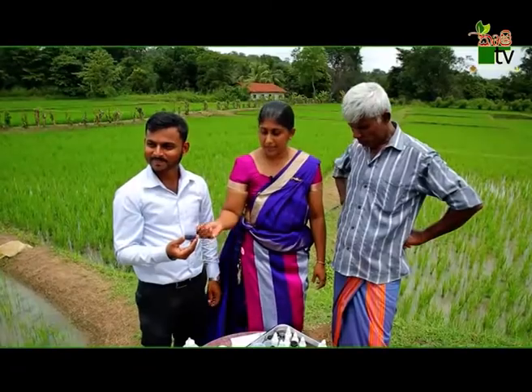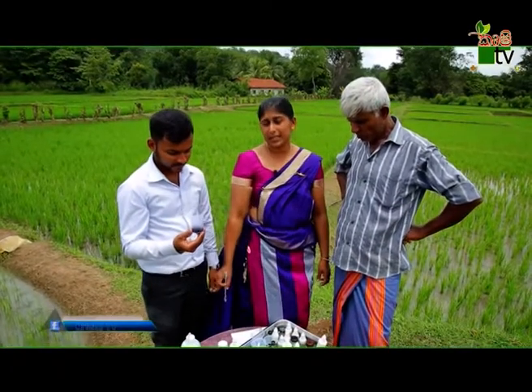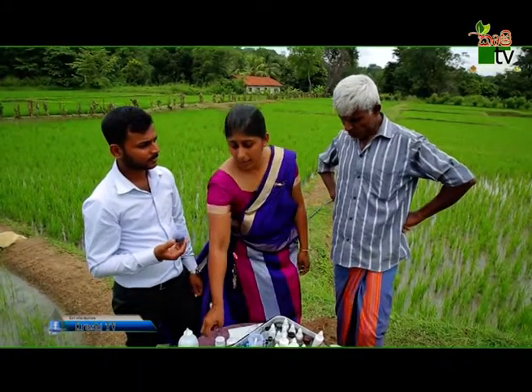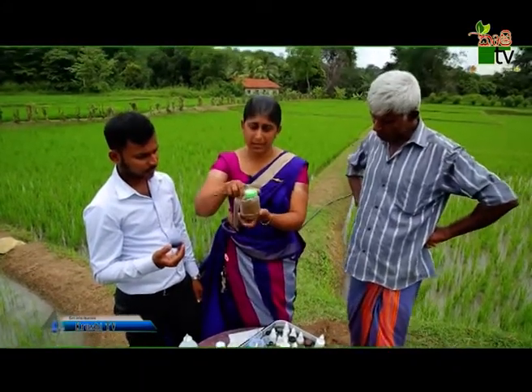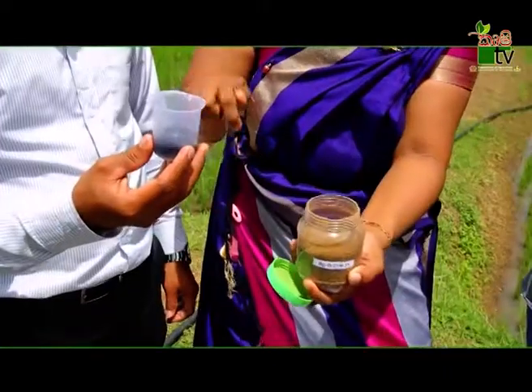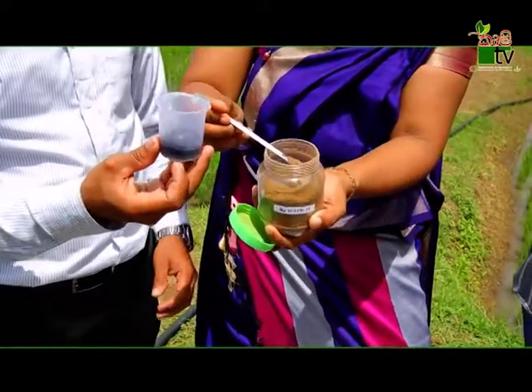Then we will add the cut to the gattu-pass. Let's put the gattu-pass on top.